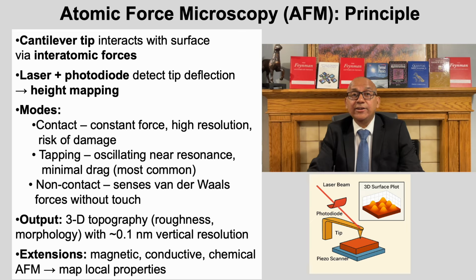A laser beam reflected from the cantilever onto a split photodiode detects these deflections with sub-nanometer precision. The feedback system keeps the deflection constant, converting it into a height map that represents surface topography in 3 dimensions. AFM operates in several modes, each optimized for different materials.